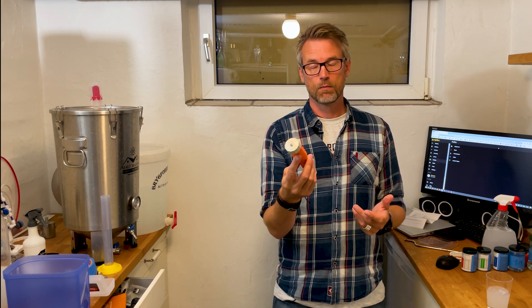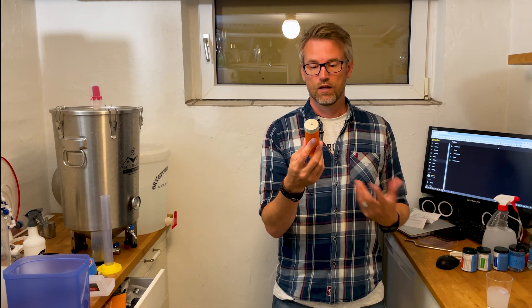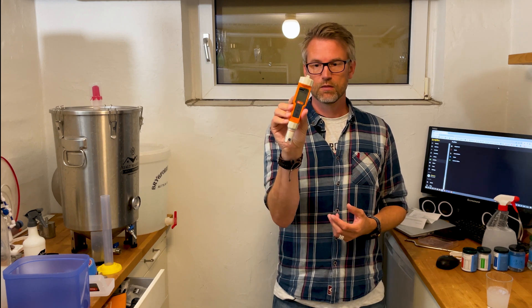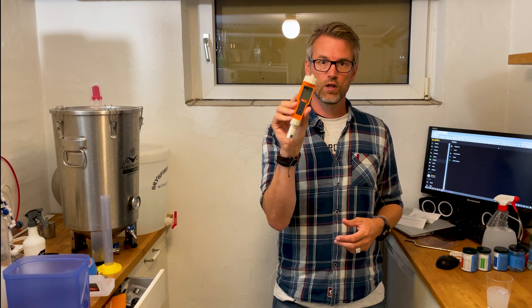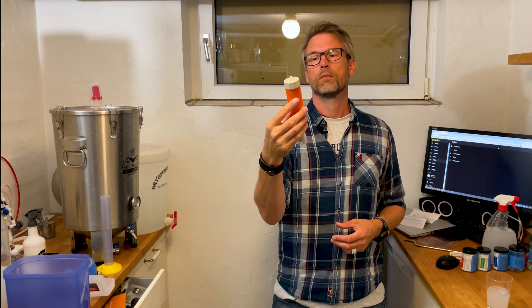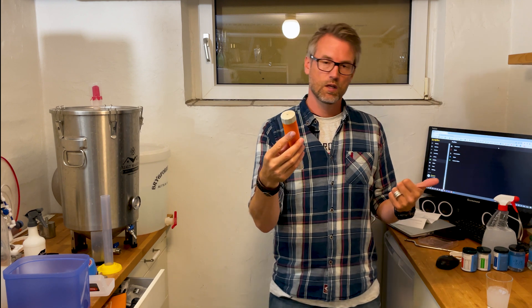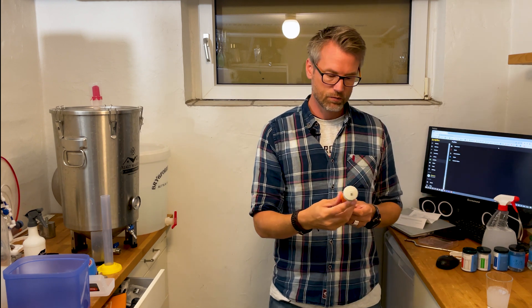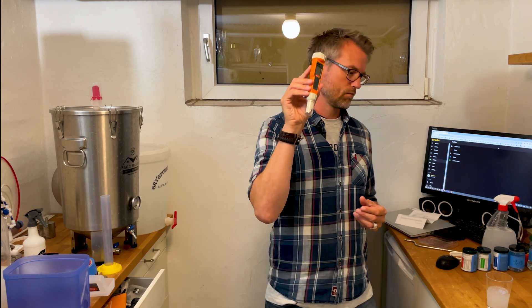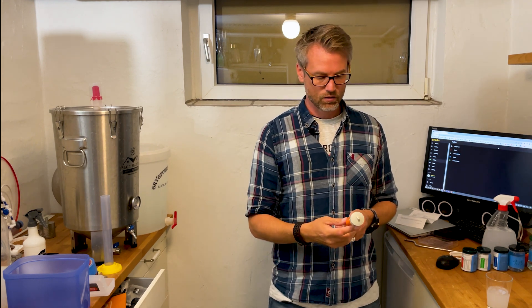I calibrate mine every time I use it because it's so simple. With this pH meter from Cakeland it's really really simple. I really recommend it because it has automatic temperature calibration, so you can measure in temperature, and it has a smart calibration function as well — I think it's just genius.